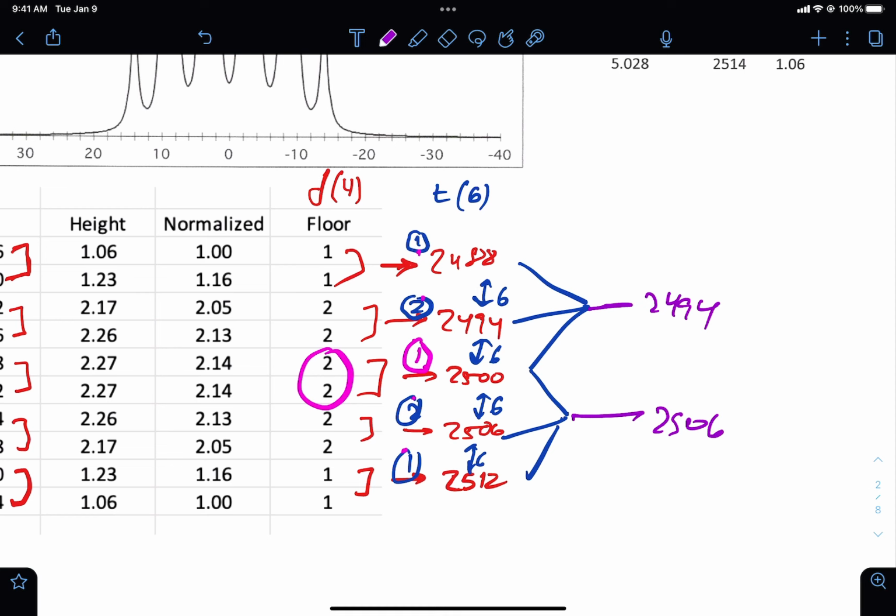So these were 1s basically. You can think of the one came down here, so that was from a 1, and this was from a 1. Regardless, we have 2 signals. That's clearly a doublet. The only way you could have 2 signals is in a doublet.